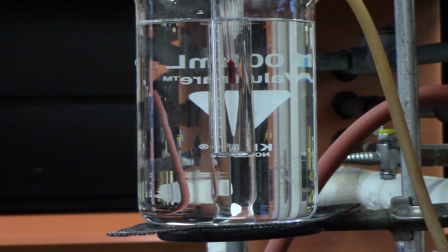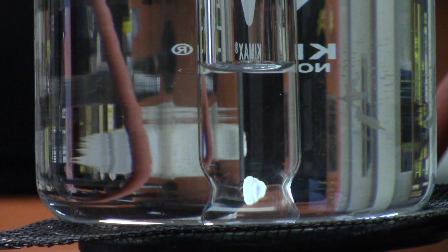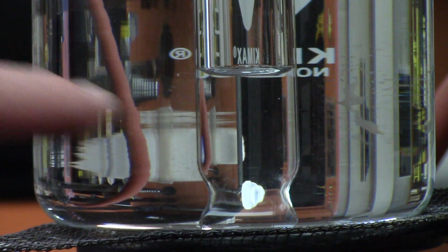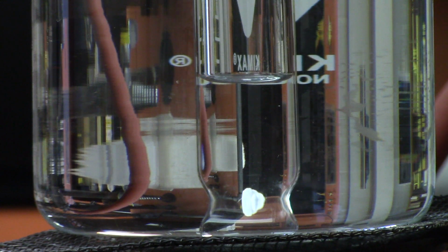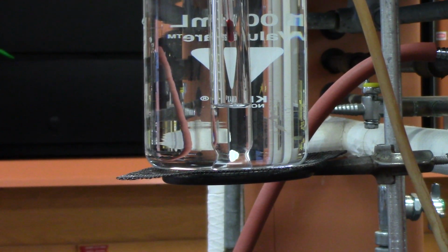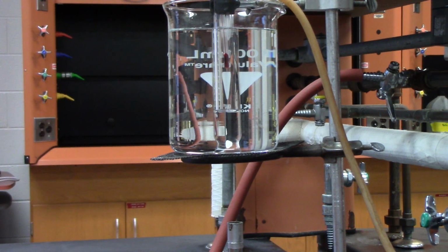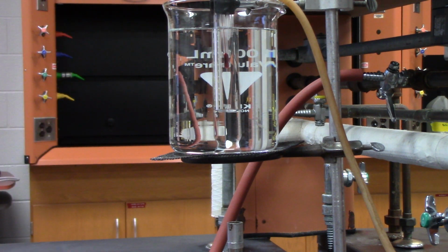Okay. Now if you notice at the bottom of the test tube, I don't know if you can see it, but there are some little rocks, and those are called boiling chips, and what they do is they help the boiling go smoothly. Okay. All right, so we heat it up, and what happens is the temperature of the unknown will increase, and so the thermometer's temperature will rise, and it'll keep on rising.